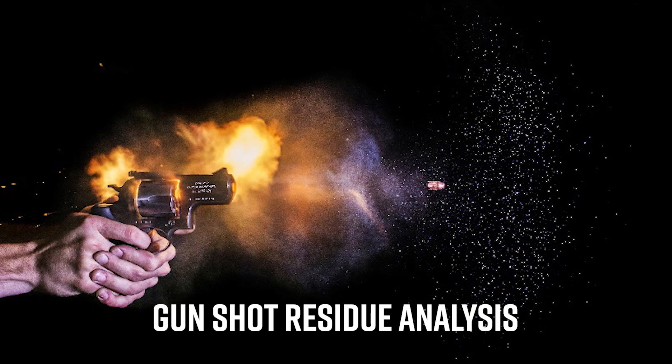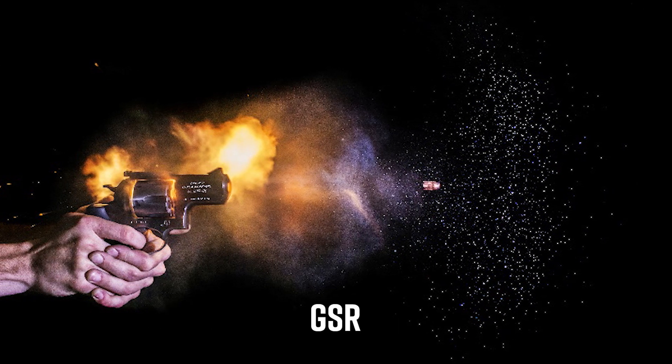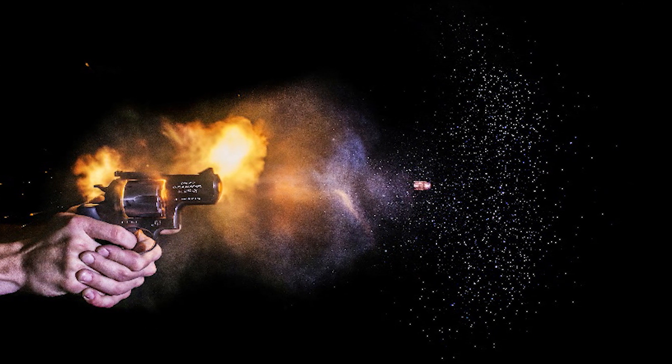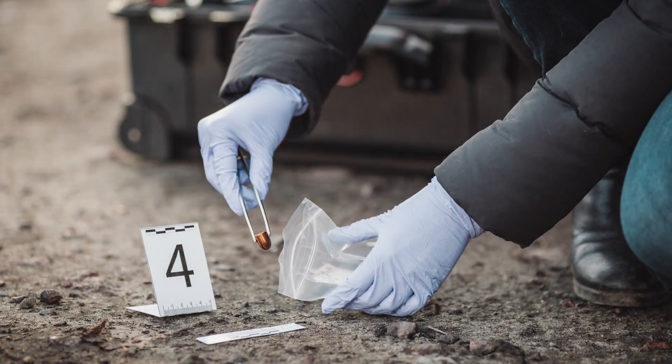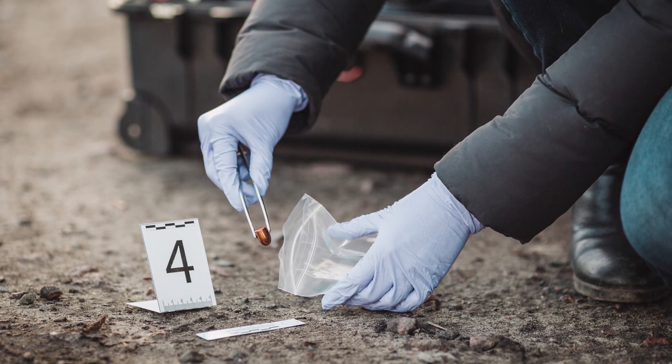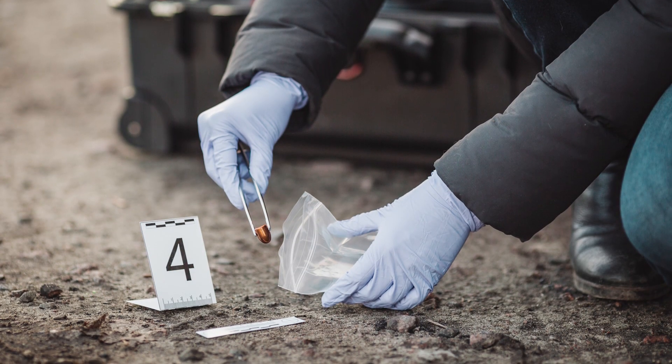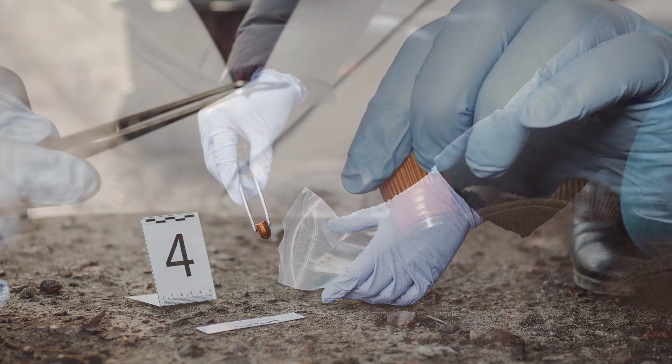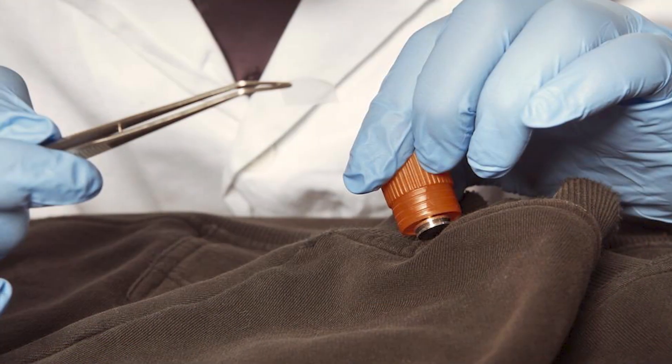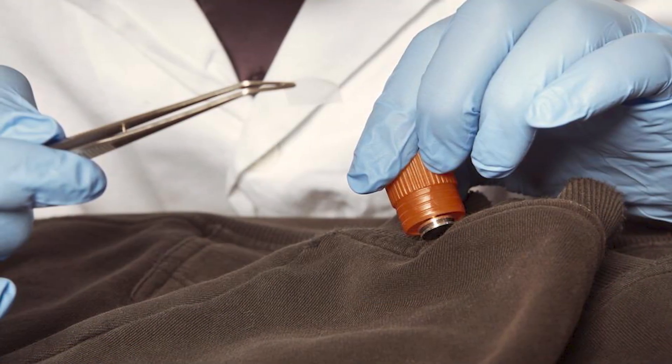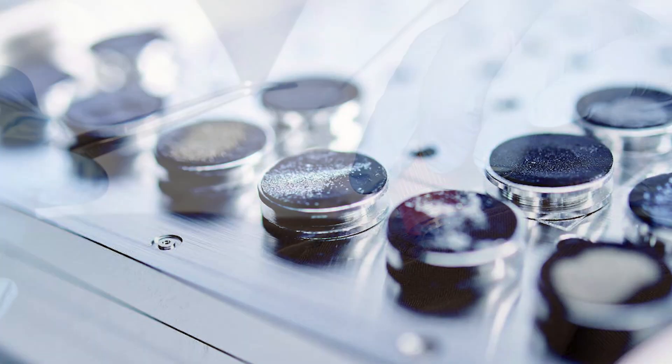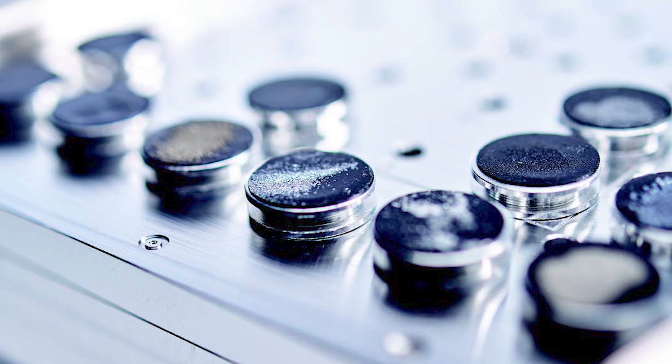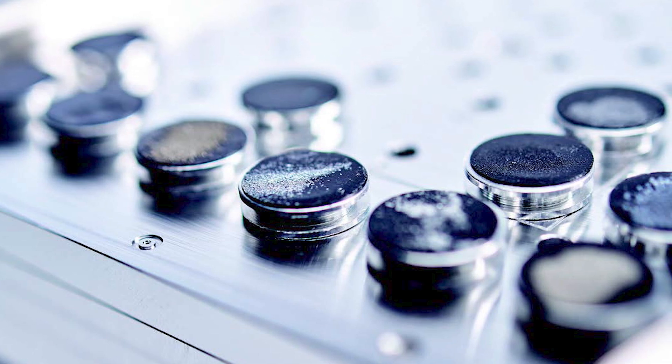Gunshot Residue Analysis, or GSR, is a specialized branch of forensic science that focuses on trace evidence left by suspect shooters. GSR samples are often analyzed using scanning electron microscopy, or SEM, but this can be a menial and arduous task if done manually.